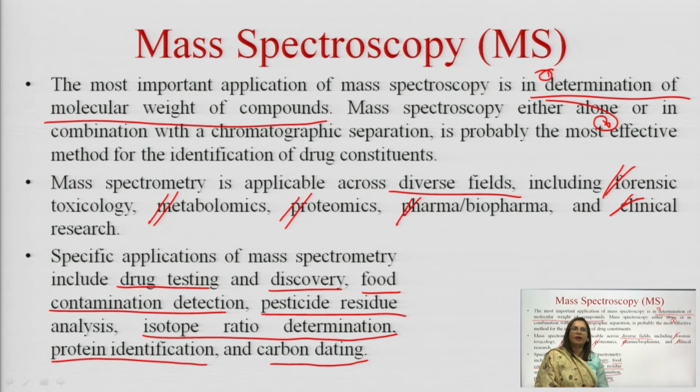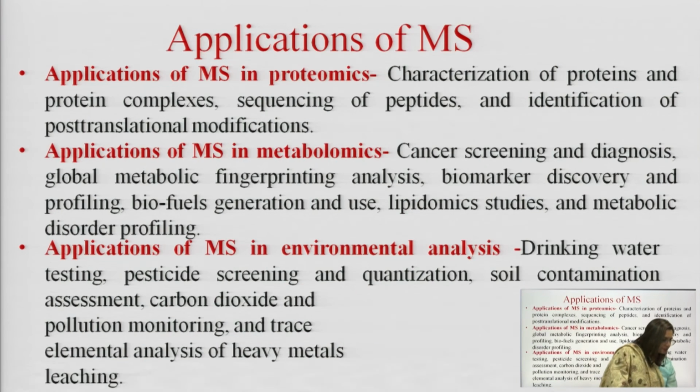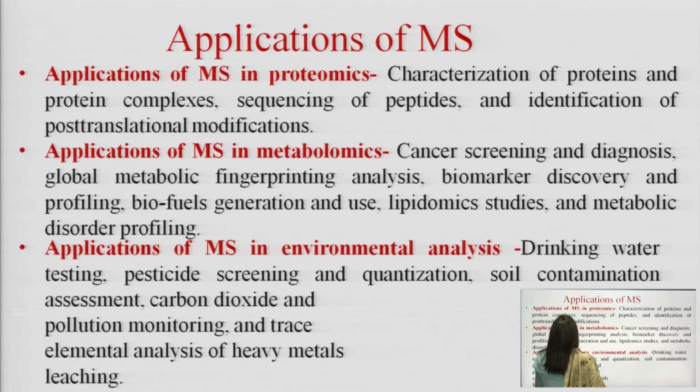So, identifying the biologically active isotope is important, and determining the ratio of such active isotopes is important. Then pesticide residue in the control or standardization of herbal medicines or any other formulation that is intended to be used in the food industry is also an important part of mass application. Okay.